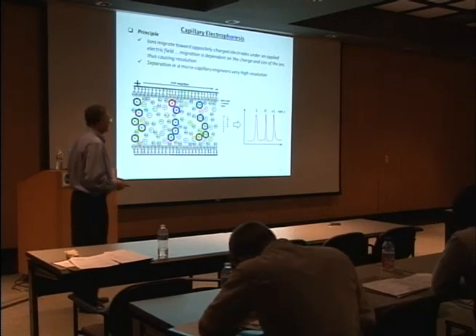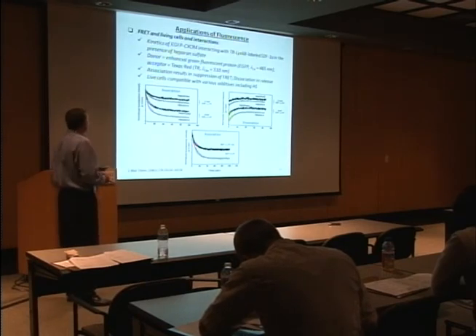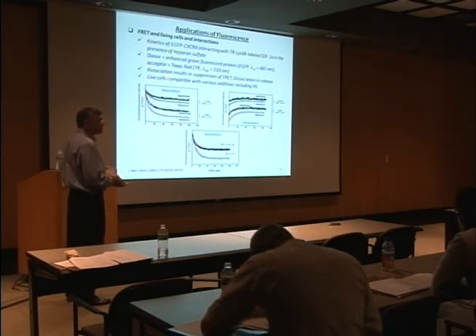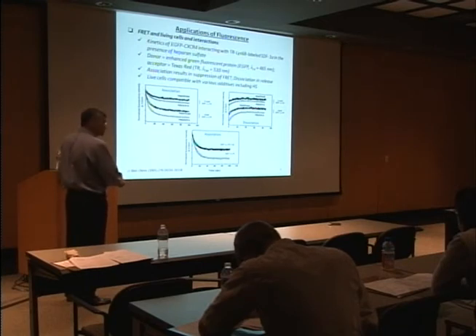They had a fluorophore at lysine 68. The lysine 68, right? Lysine 68, yeah. Why there? I don't really know. It's just an easy place to put in a carboxylic acid. But 68 is essentially at the end, right? Yeah, it's at the C terminus, so it's practically at the end. So maybe they figured, wow, it's a good place. This is an old paper, by the way.